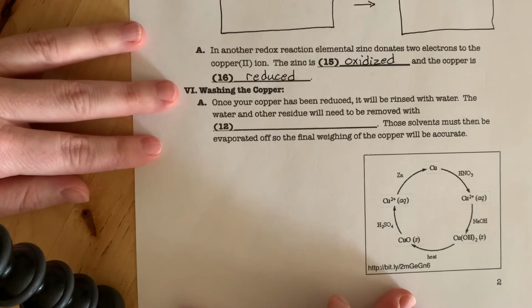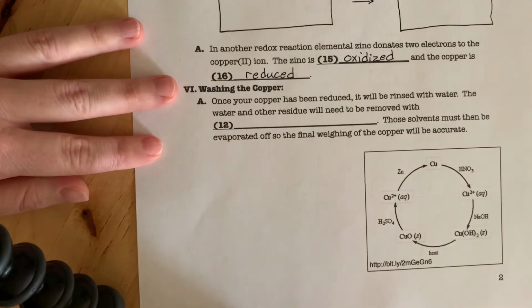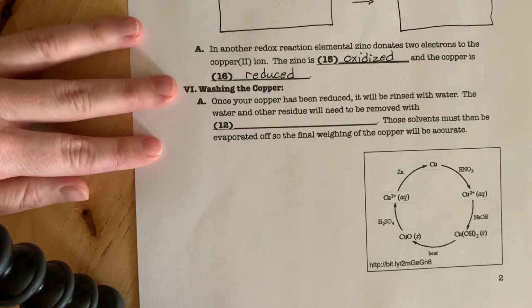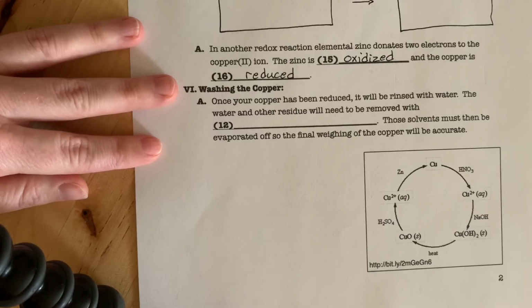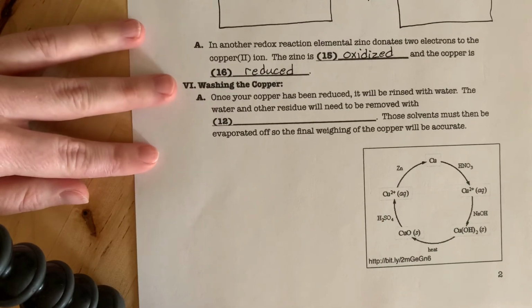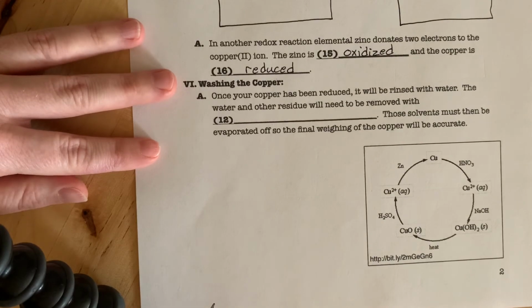So after you've finally gotten your copper out of solution, you need to wash your product, your elemental copper. As you've seen when you figured out your principal species in solution, there are tons of ions still in solution that could be stuck to your copper. So you're going to need to wash that with some deionized water and then dry it fairly quickly.